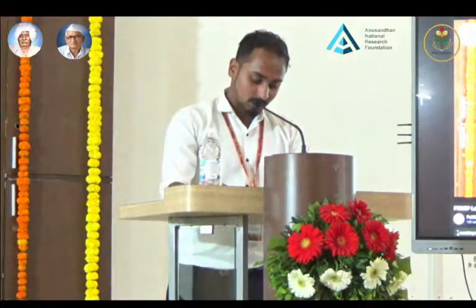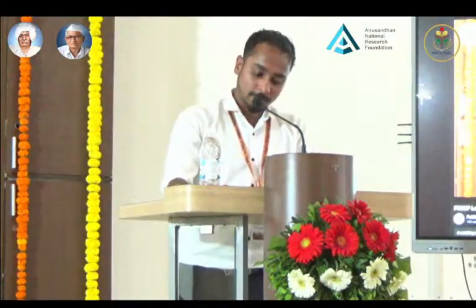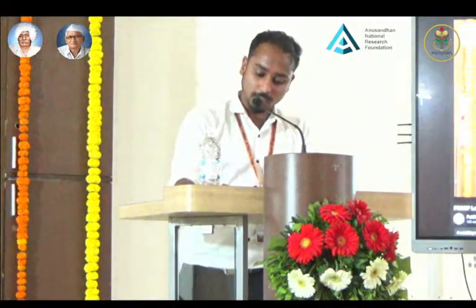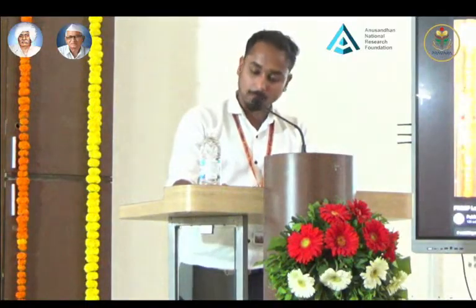During this session, Sir successfully isolated a total of 6 phytochemicals: starch from potato, embelin from Embelia ribes, quinine from cinchona, caffeine from tea powder, trimyristin from nutmeg, and separation of blue and yellow-green dye color by column chromatography. This live demonstration made the concepts much clearer and more meaningful.